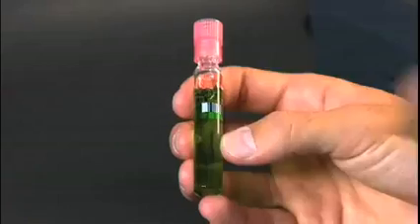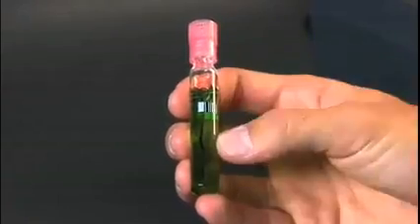Now let's get a reading. To demonstrate the accuracy of the TNT Plus, I'm going to mark this vial with a pen. Just insert the vial into the spectrophotometer and the instrument does the rest.